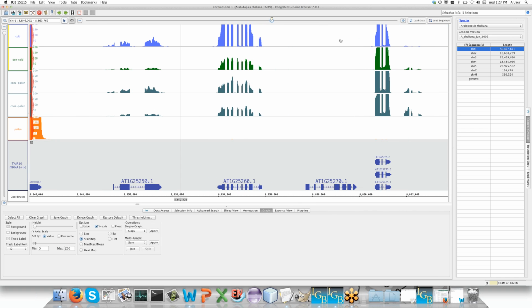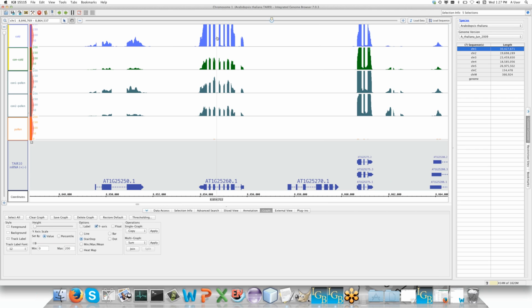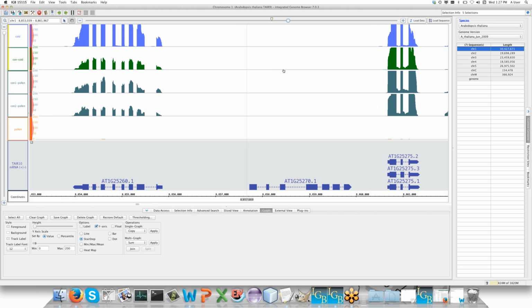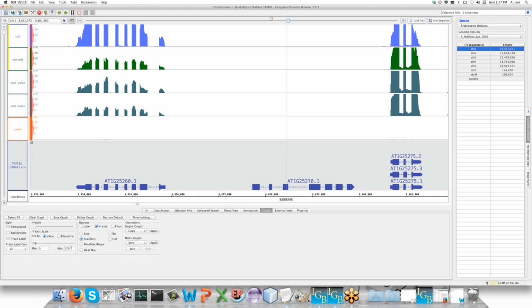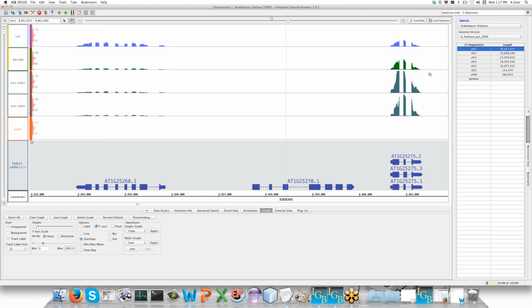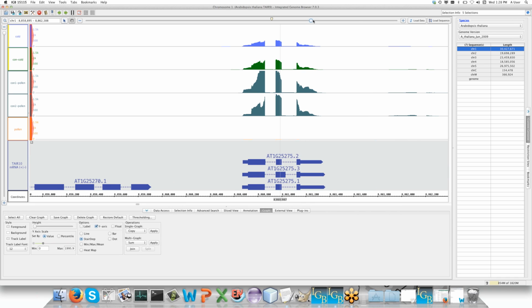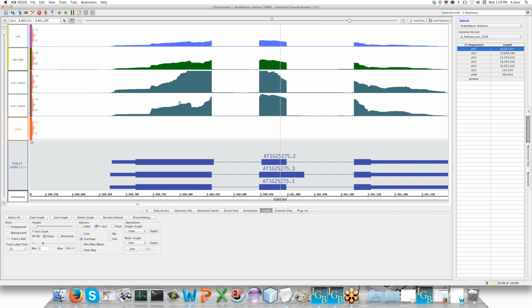Now, as we were seeing before, we seem to have in this gene, the 6.0 and the 7.5, differential expression based on temperature, which is usually what you're looking for, is that your treatment should have an effect. So once again, I'm going to run this back up to a larger number and begin to show you. Here, it's fairly evident to the eye that even though the matching control is lower than the other two controls, the cold is lower yet further. But it's a little difficult to compare them like this.